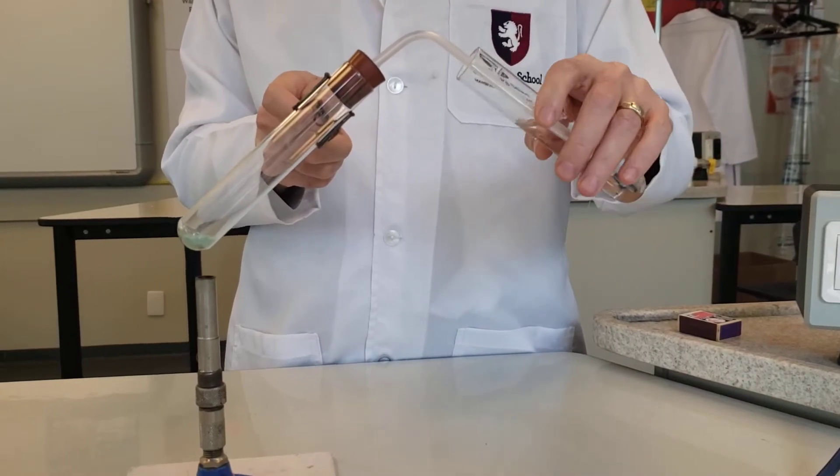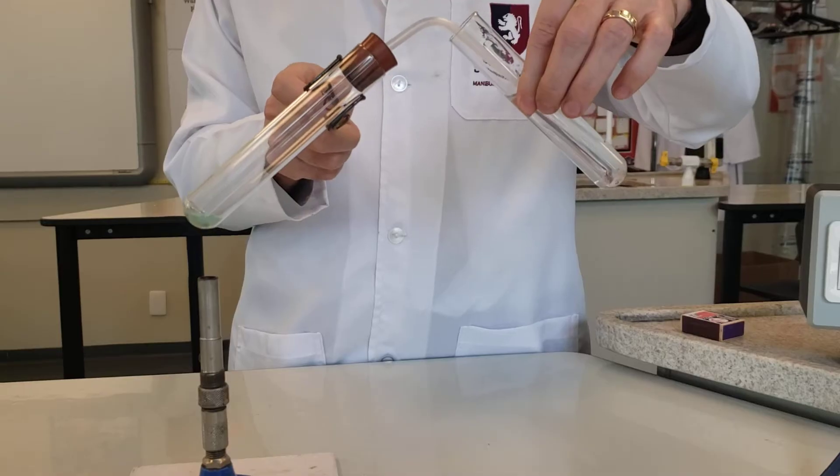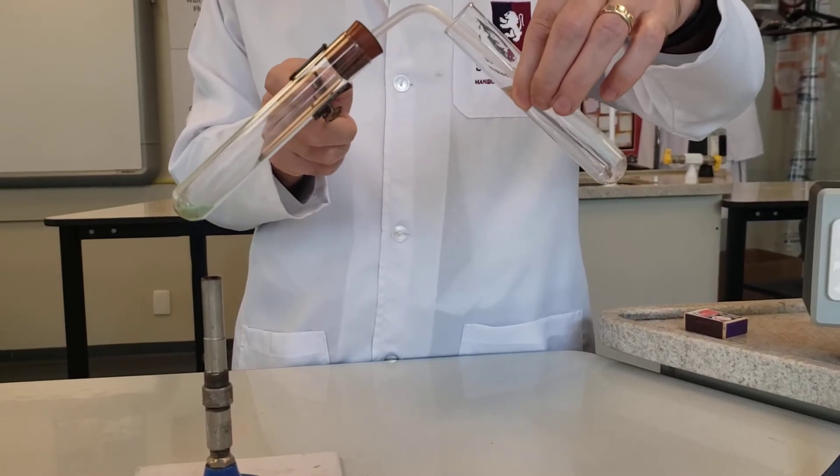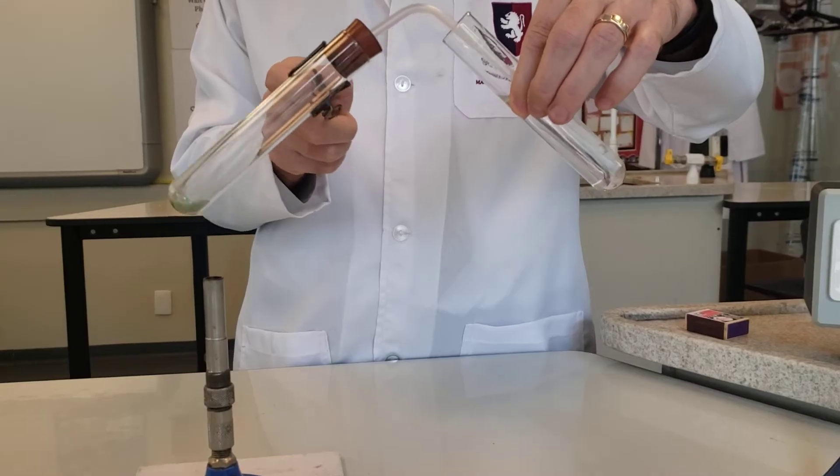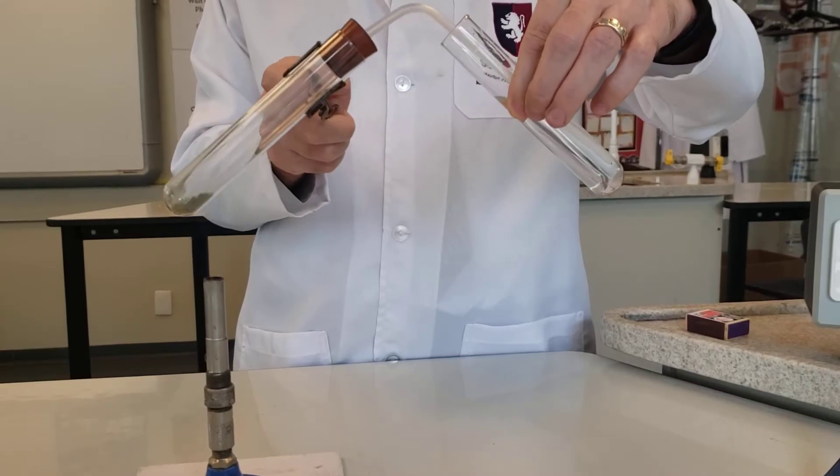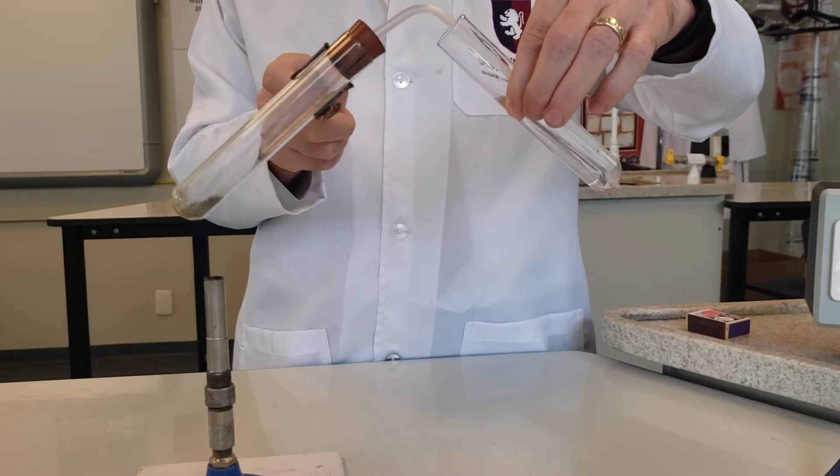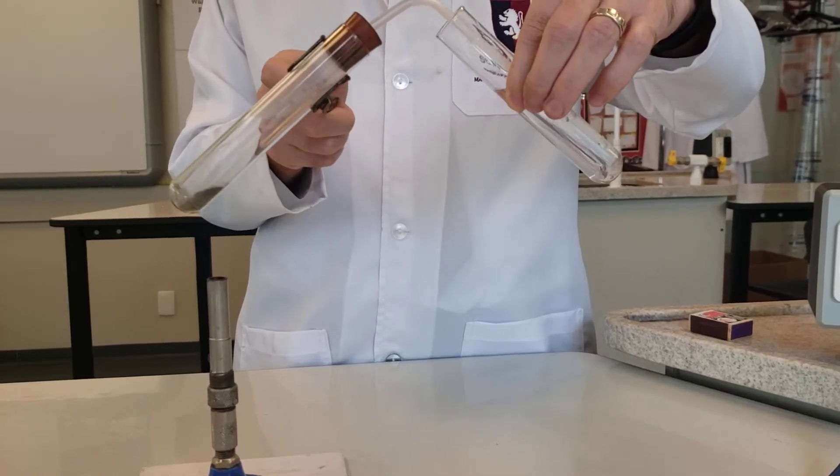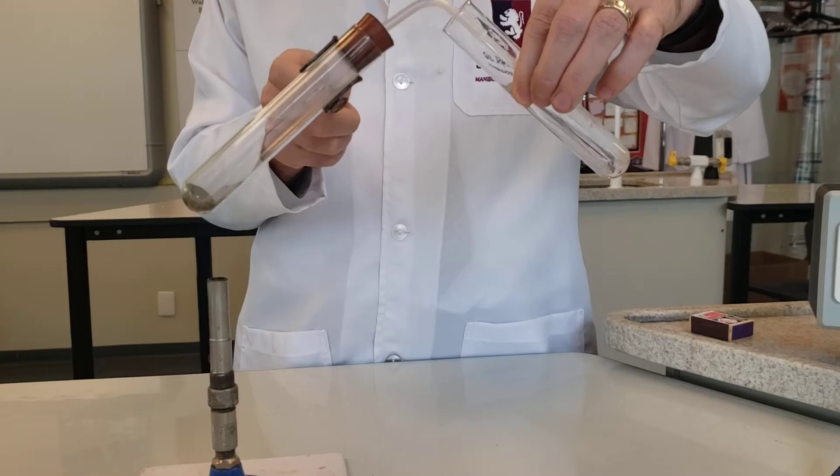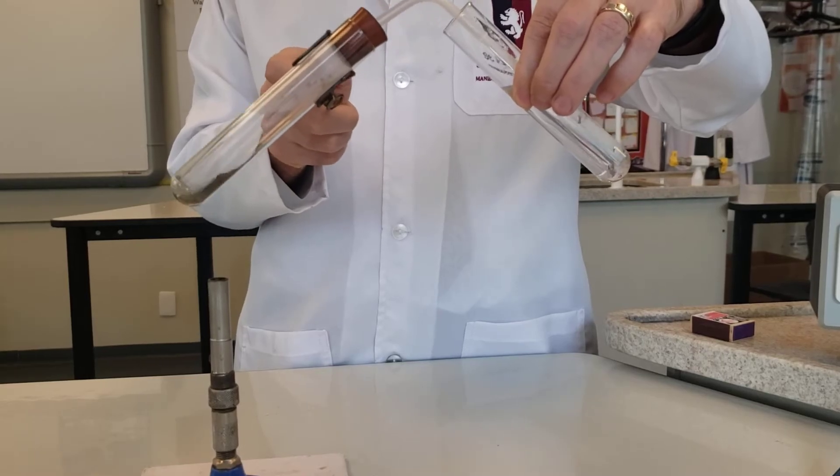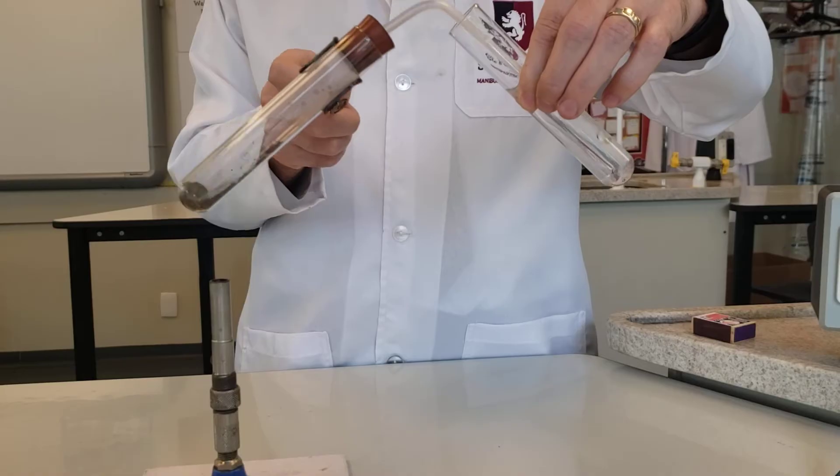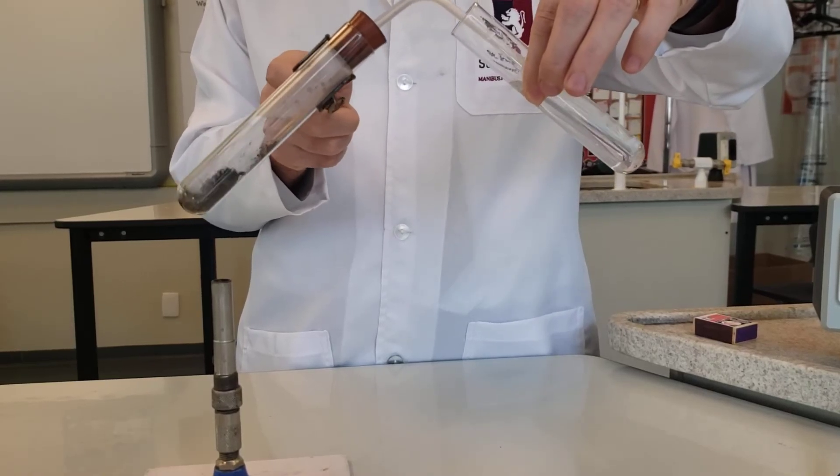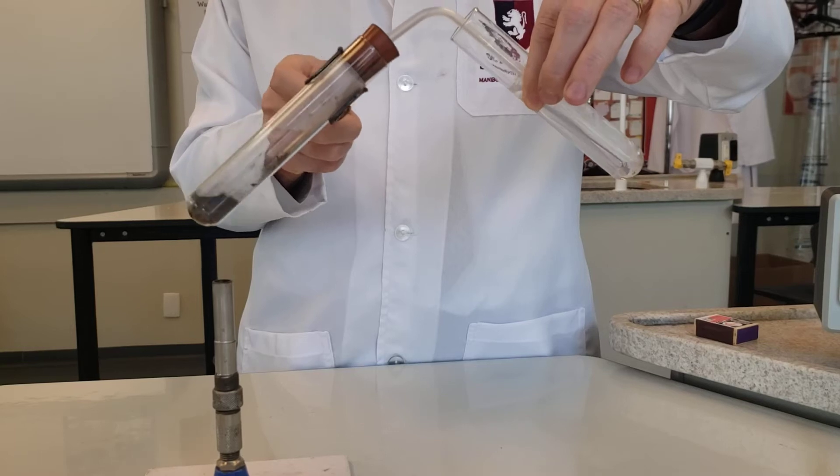The first few bubbles that come out of the tube are not gas being produced. It's just expansion of the air inside the tube. And quickly you can see that my copper carbonate is changing colour. It's going from a light green colour to a dark black colour. And now I've got quite strong bubbling through into the lime water.